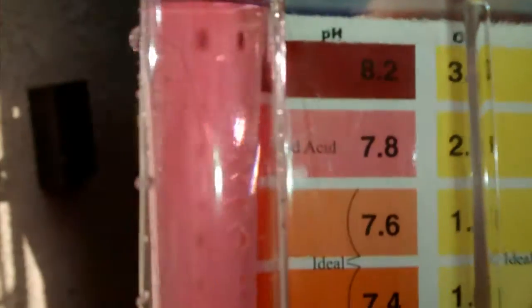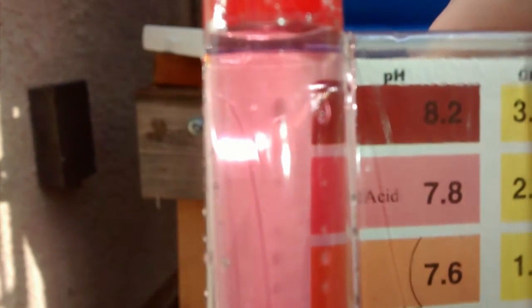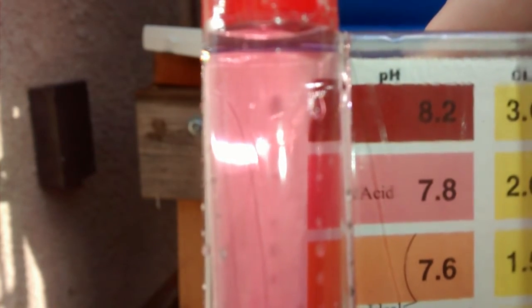So that's the result of the pH test. Let's take another close look — there's a little bit of a glare, so let's move it over. There you go. I'd say it's probably around 7.8.